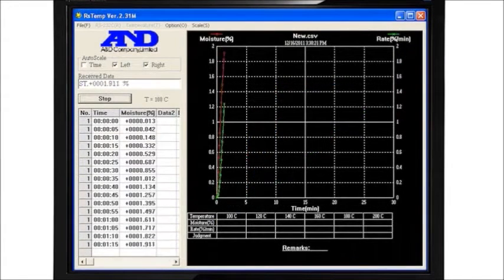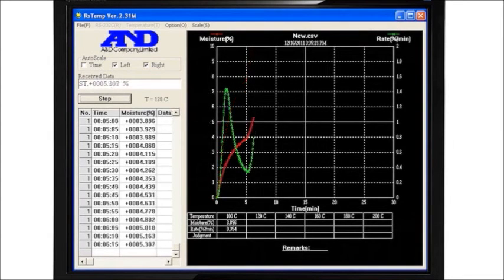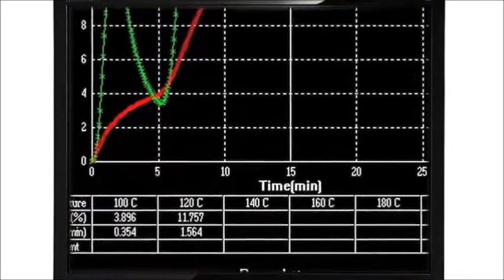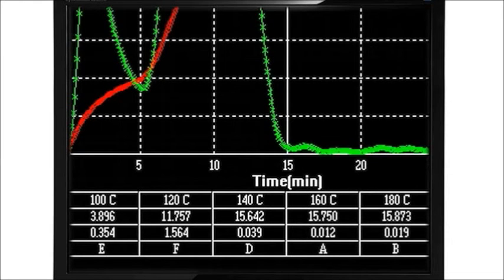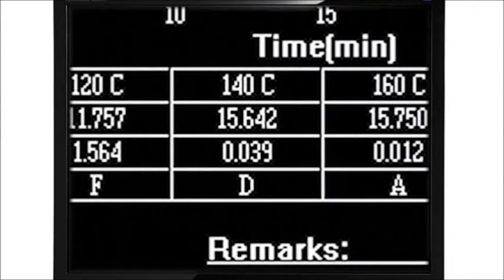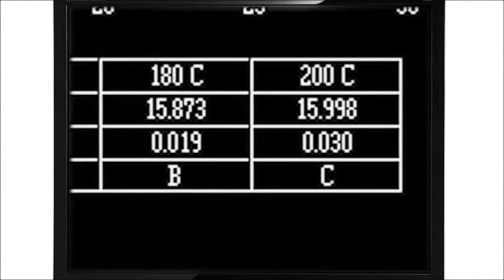Not sure at what temperature to process your sample? The RS-Temp function of WinCT automatically determines the most suitable conditions by changing the applied heat over any range from 30 to 200 degrees C. It outputs a letter grade indicating the optimum test temperature, which you can then make the basis for future tests of the same material.